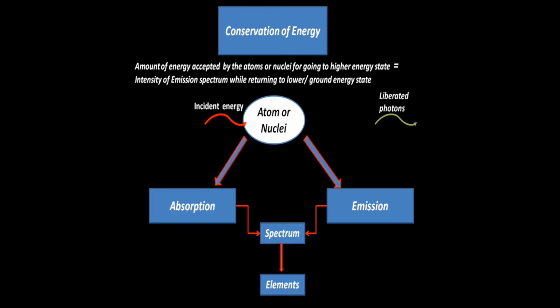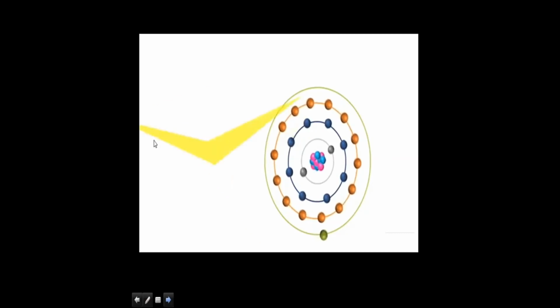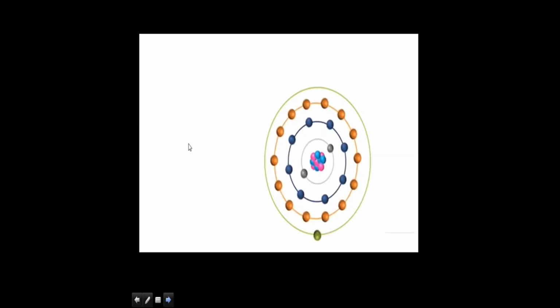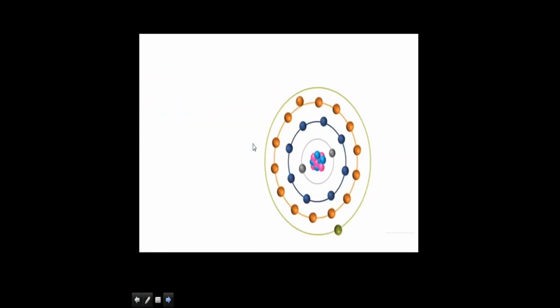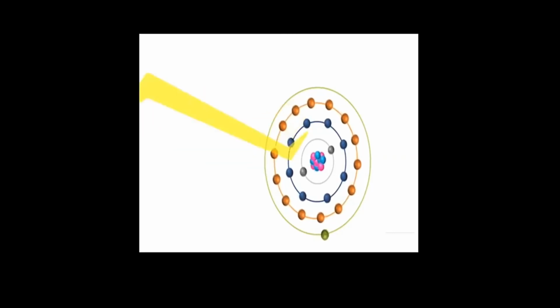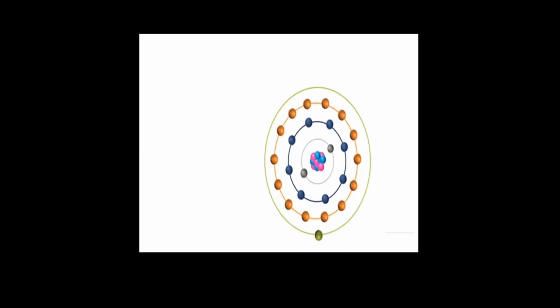So how does it all happen? A sample of the metal is brought in contact with the flame in either solution or solid form. The flame has a temperature ranging from 3300 to 10,000 degrees Kelvin. This thermal energy supplied by the flame actually does two jobs. It breaks the chemical bonds to create free atoms at the sample interface without actually penetrating through the surface.